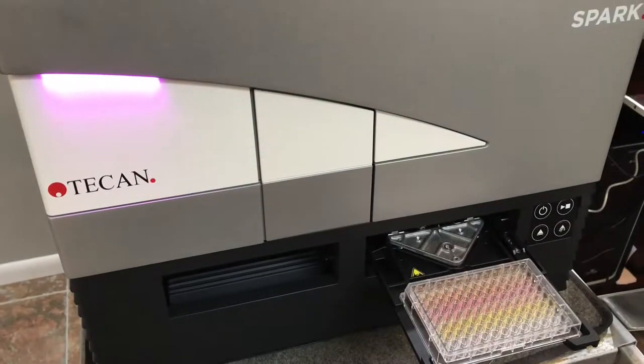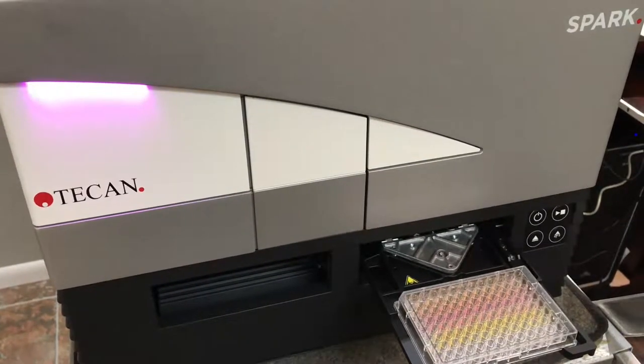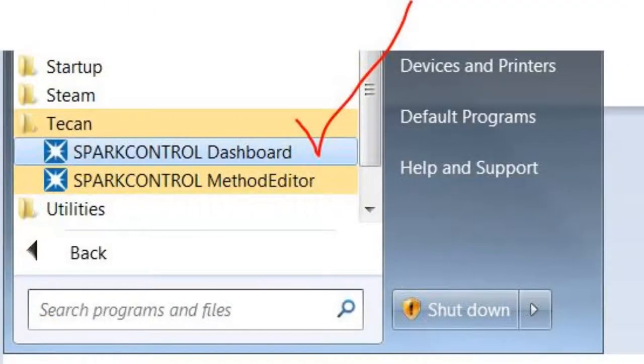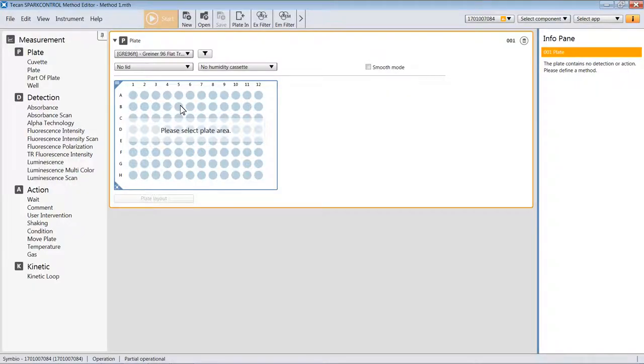With your reader and computer turned on and the status light of the reader at Magenta, launch the Spark Control dashboard software. Once in the dashboard, click on the Method Editor New button to begin writing a method.